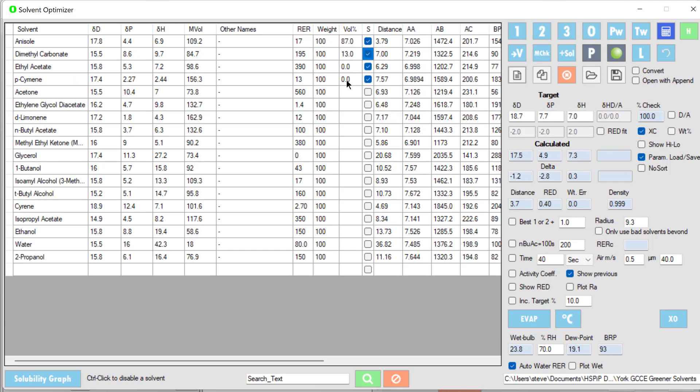The solvent optimizer allows you to do all sorts of smart optimization of solvents and solvent blends to achieve your targets, balancing evaporation rates, toxicity, safety, and cost.